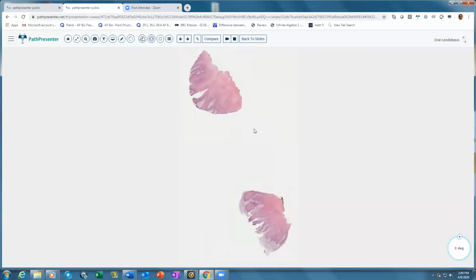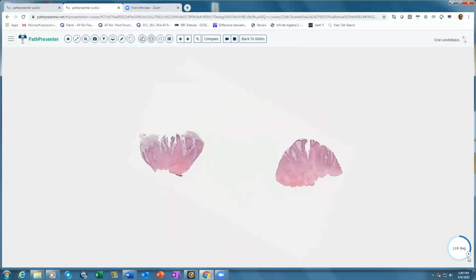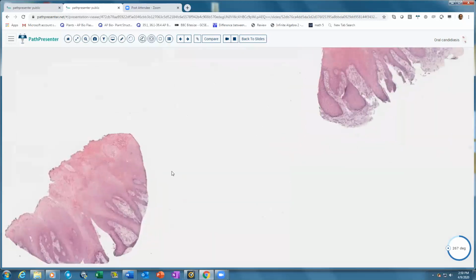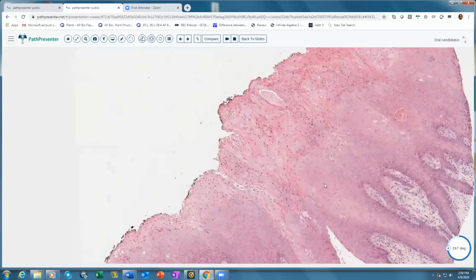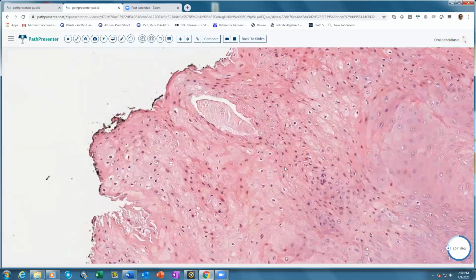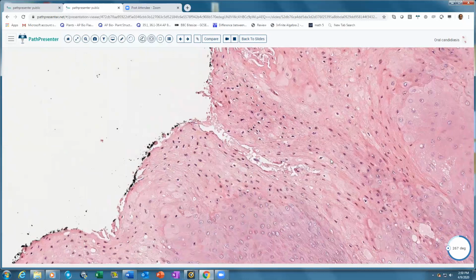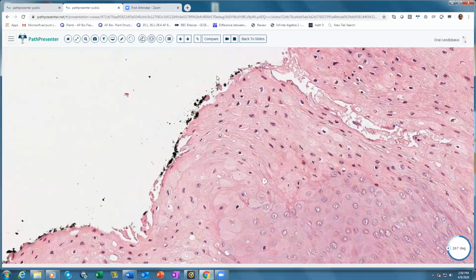When we talk about candida, it is usually associated with a mucocutaneous infection, in a mucocutaneous biopsy. Here you can see no granular layer, so we know we are dealing with a mucocutaneous lesion. Even on the H&E, some of these fungi are easily visible, but if you do a PAS stain, then it's very easy to see them.